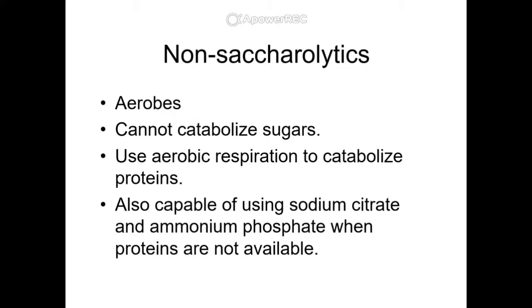Non-saccharolytics are aerobes, but they cannot catabolize sugar. Remember Saccharomyces, sugar-eating fungus, that means sugars. So non-saccharolytics cannot catabolize sugars. They use aerobic respiration to catabolize proteins instead. And some of them are capable of using a compound called sodium citrate and ammonium phosphate when proteins are not available.